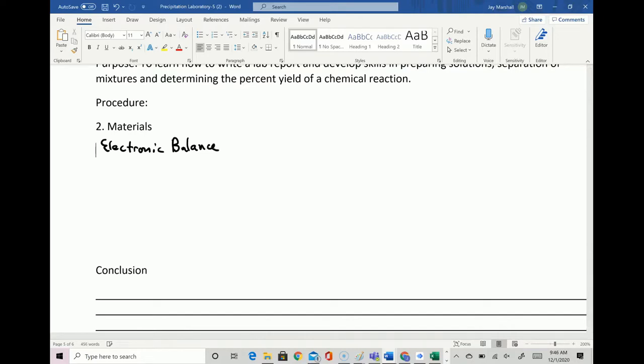Okay, what do we usually put on an electronic balance so that we don't get crap all over it? White paper. And we just used a sheet of paper. They actually have a special type of wax-coated paper for that we could buy, but it's more expensive than we want, so we just use regular paper. And then what did we weigh on it?